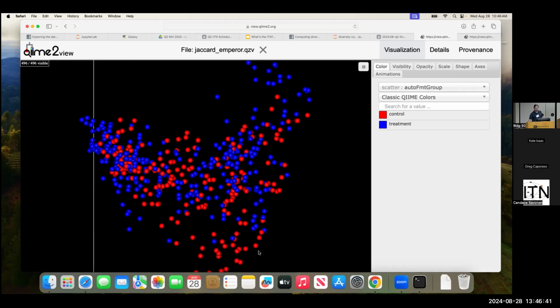Okay, so what we just did here was run a couple of different QIIME2 analyses. These are classic plots that people are familiar with from QIIME2. And like I said earlier, these are almost always some of the first things that I will do when looking at data from a microbiome study. At this point, your analyses tend to become a little bit more customized to the specific questions that you're interested in. And so, where Chloe left off, she said, we looked at this plot.